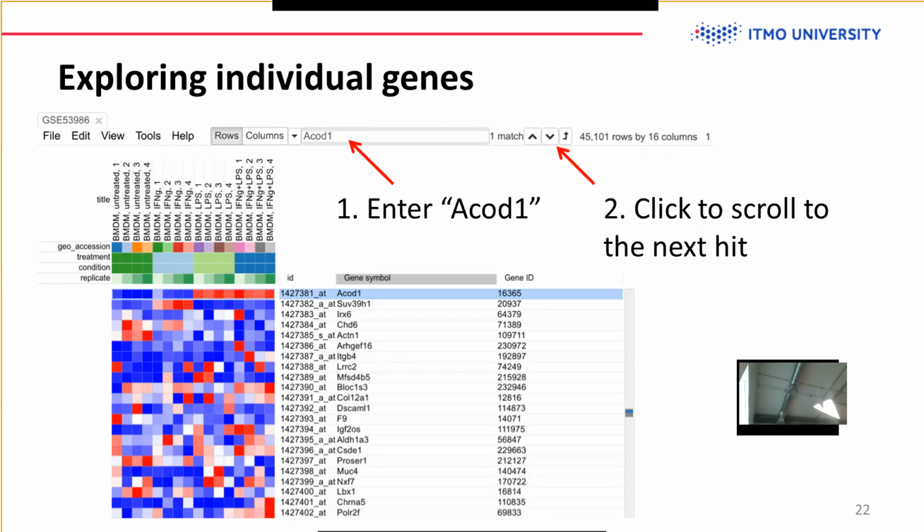For example, when you do RNA sequencing data analysis, it's actually better to capture, in the processing steps, all the genes that are possible. The better annotations you have, the better your results will be. And this means that your results will be in Ensembl genes, and we'll look at it tomorrow.